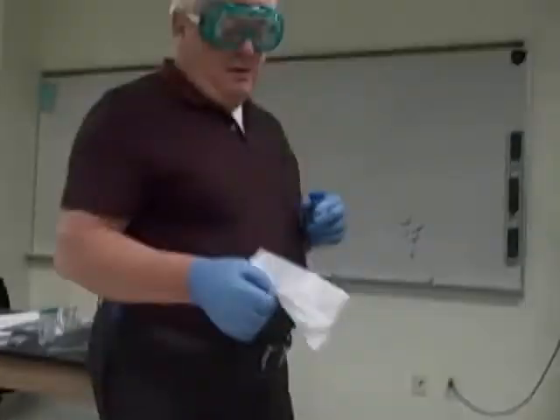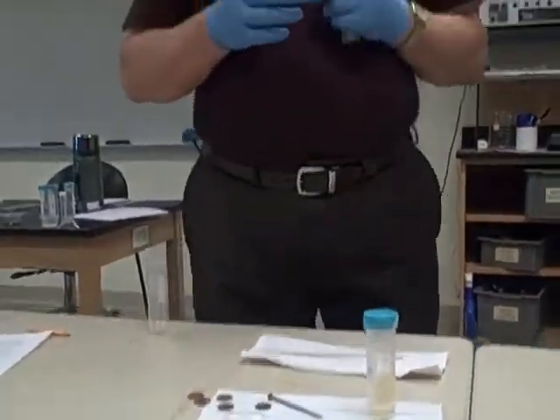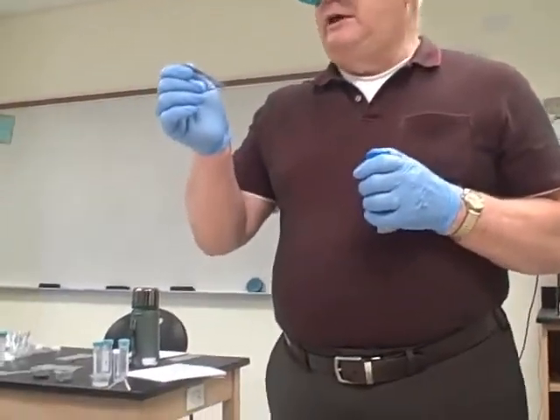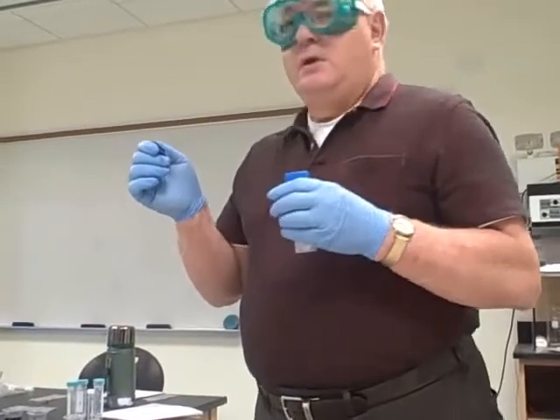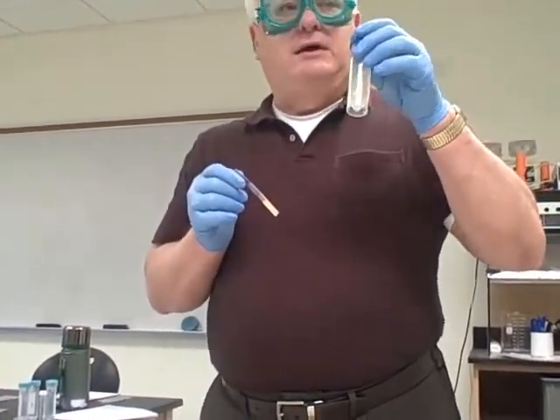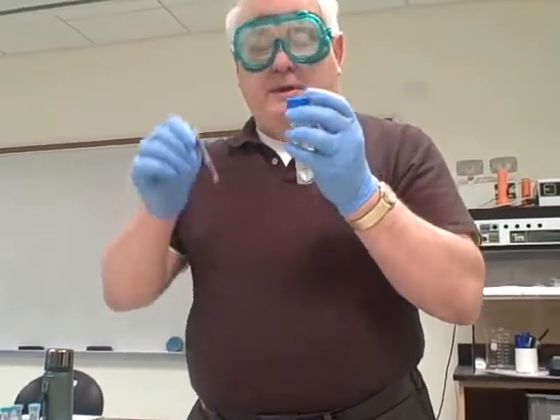Another one of the experiments, since we're now dealing with coating metals with other metals, in our case, we're now going to coat a relatively cheap metal, namely copper, with an expensive metal, namely silver. Electroless plating of copper from silver nitrate, okay?